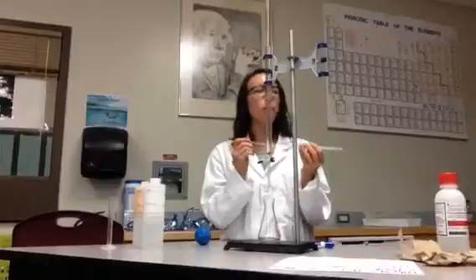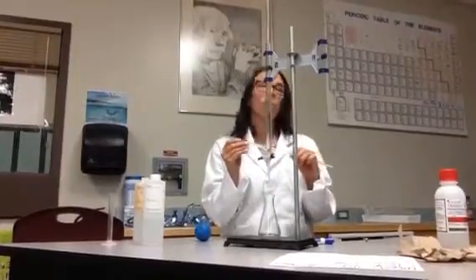So I'm going to use this other fancy new apparatus. Anybody know what that's called? A pipette. I showed you one before. Pipettes are just really exact measurements. They'll each be different, and more expensive ones are even more exact, but this one says it is 10 mils plus or minus 0.04. So the worst I can get is 10.04 or 9.96. That's the worst I could be off if I've done it right.